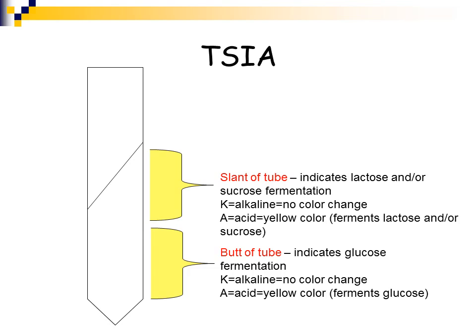In this test, you stab the organism right into the center of the agar with a needle, and then you streak the slant of the agar. You incubate it using a very loose tube. Whenever you have tube media in the clinical laboratory, you should all remember this from General Micro, you never want to have the caps screwed on very tightly or the tube will explode, because some of these organisms ferment and produce gas and will rupture the tube.